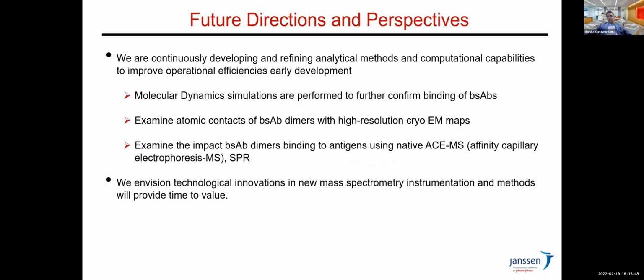Finally, as we continue to explore new modalities, I believe that structural MS tools will have their own place and will play a significant role in better understanding our molecules. We hope early investigations will improve overall operational efficiencies and bring time to value as shown here. The future efforts are listed here.